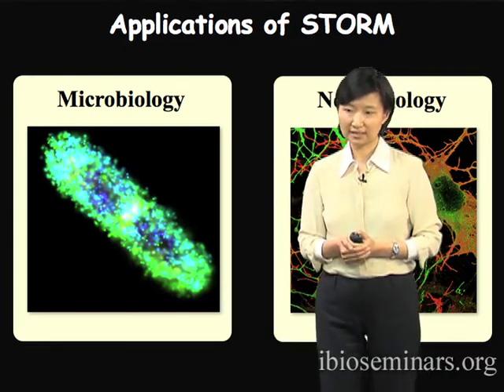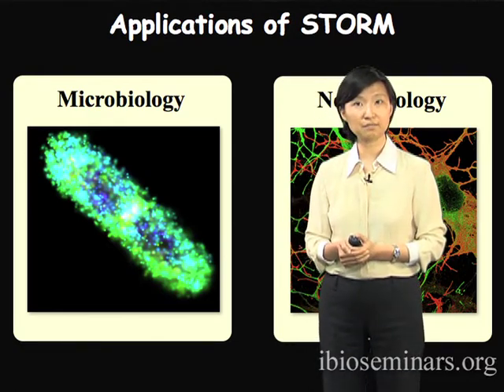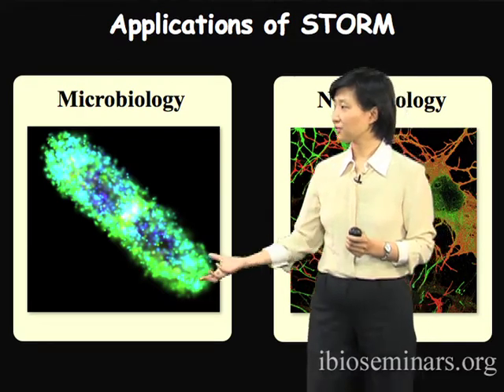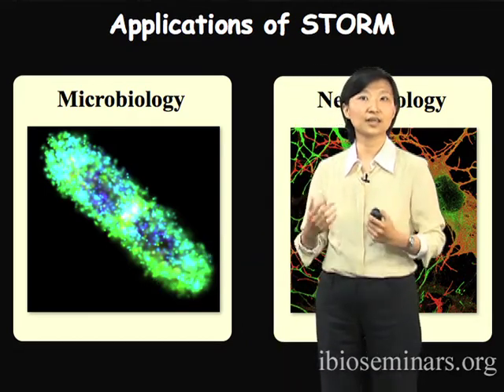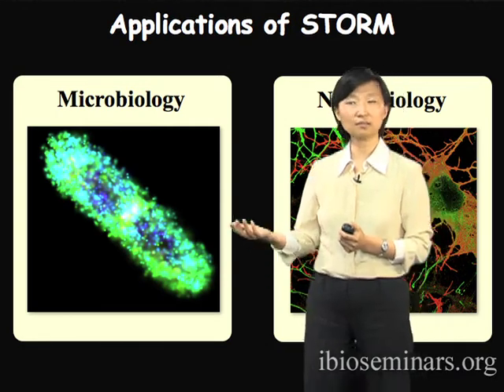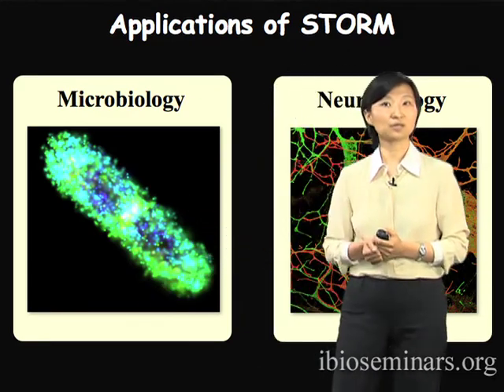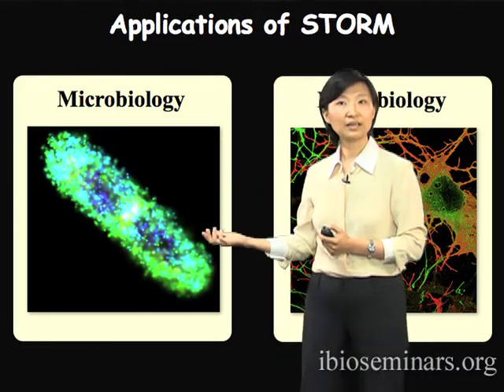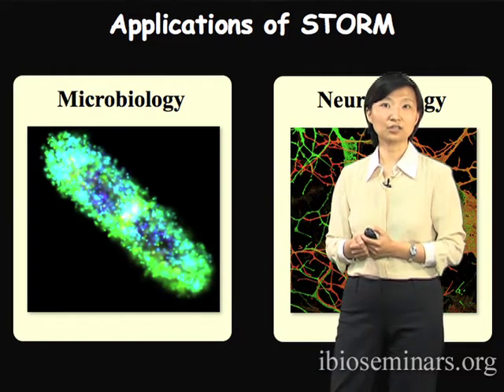And one area of application that I'm very excited about is bacterial imaging. Now, bacteria, these are tiny cells, and if you look at their width, the width is just several hundred nanometers, or sometimes approaching a micron or so, and that is nothing but just a few times the diffraction limited resolution size. So because these cells are so small, it has traditionally been difficult to image them.